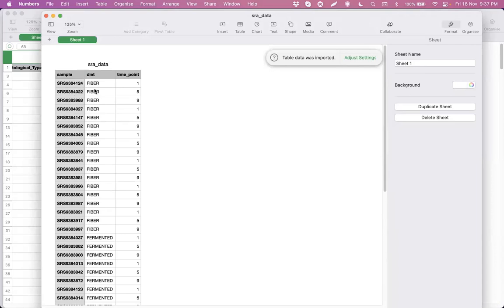So we take this, and then, for example, we selected only this data. How do we select this data? So this is selected, for example, based on the diet that they have and the time point. I want to find out their progression of abundance levels according to after first week, after 5th week, and after 9th week. So how you set up this analysis is up to you, right? I am interested in this, and if you want to find out only after 1st and 9th, then it's fine. Or if you want to focus only on 1st week or after 9th week, it's up to you. So that is how you set up this analysis.